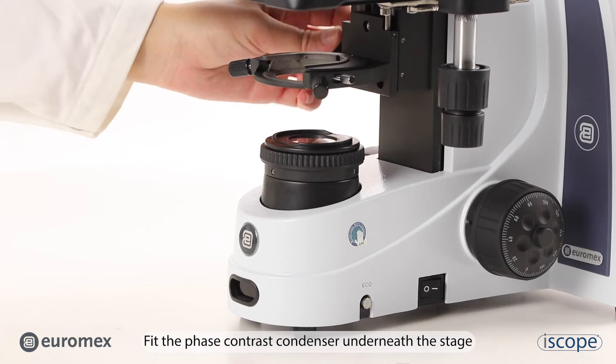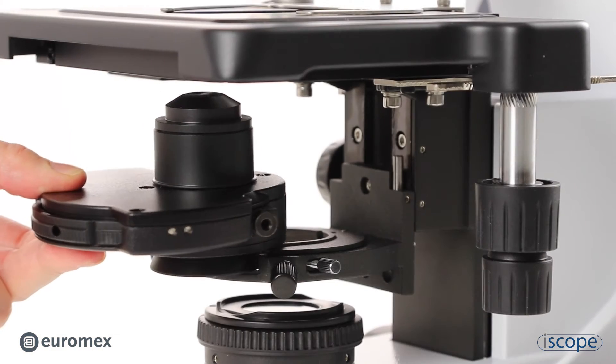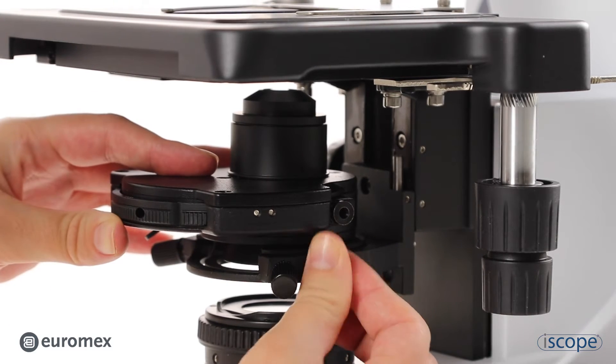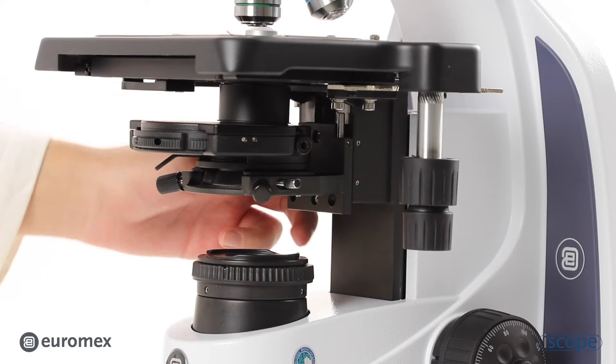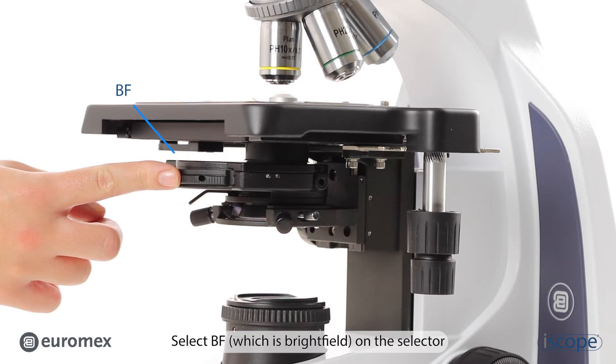Fit the phase contrast condenser underneath the stage. Turn up the condenser. Select BF, which stands for brightfield, on the selector.